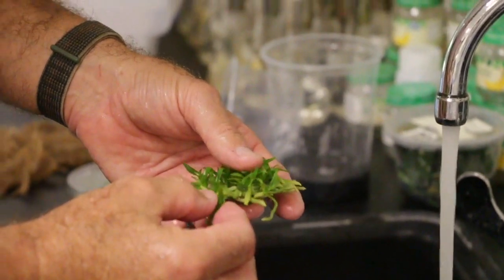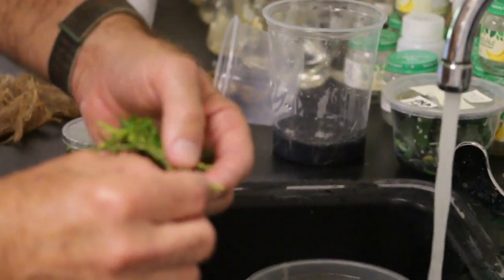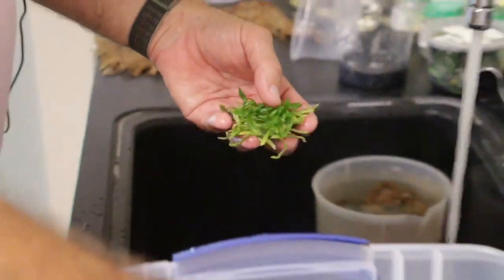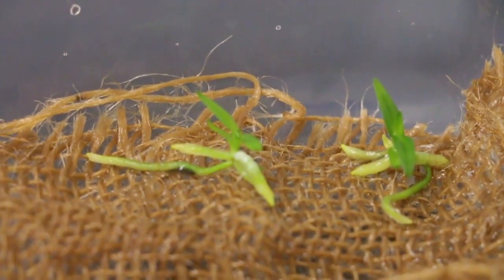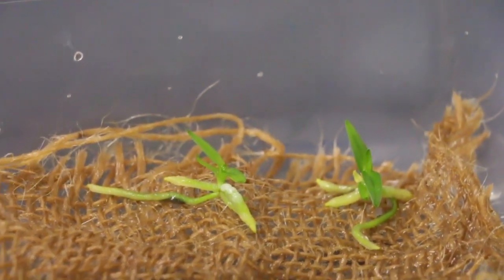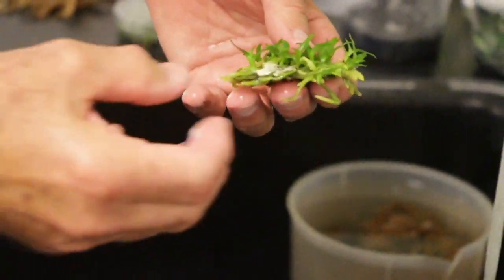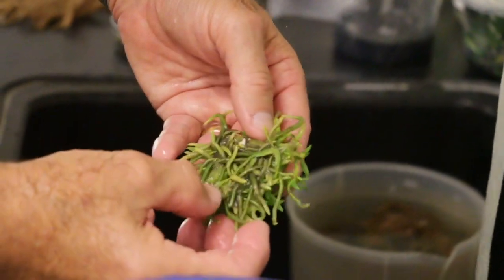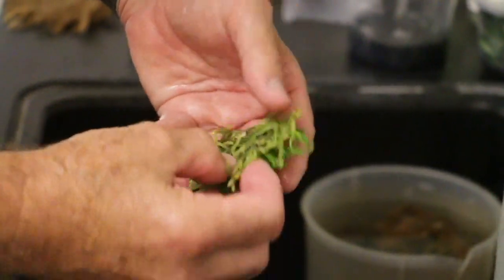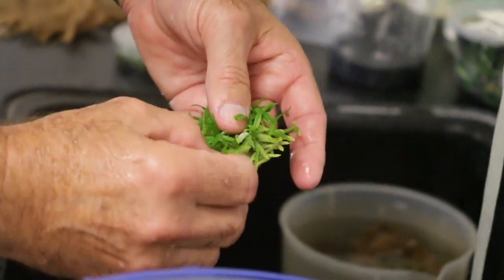But like I said, these are small, and they're stuck together. I think they'll fit in here nicely because they're cattleyas. So I'm trying to tease them apart a little bit. And here's our contamination here. I'm trying to get rid of that. It is a mat of orchid roots, and this is how it was growing in the plate, and that's what the next plate I think is going to look like.